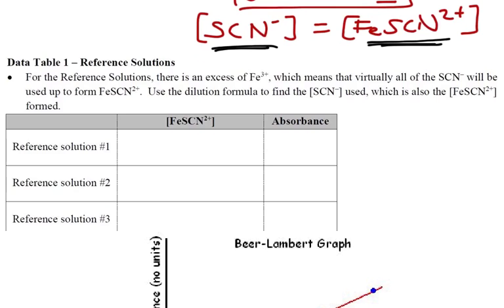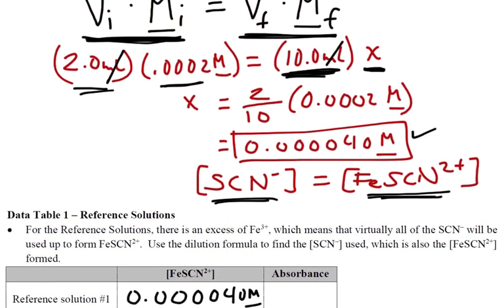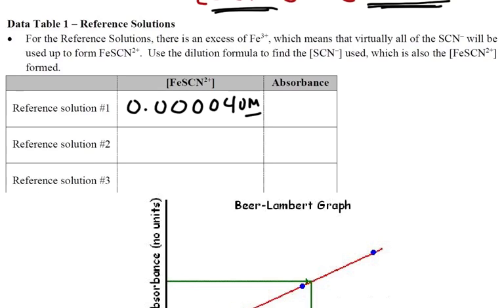So you can see what's going to happen is you have taken that first recipe and calculated that this concentration is 0.00004 molar, and let's maybe double check that, yes, 4 zeros and a 4, 0.00004 molar. Then because you used the colorimeter, you know what the absorbance is, so you're going to plot your values.